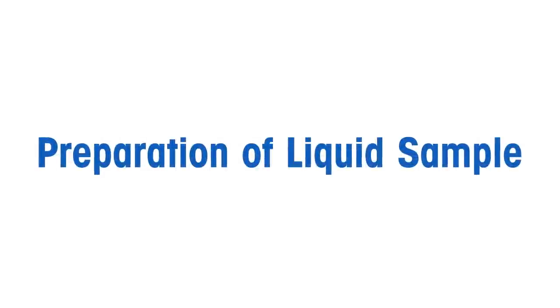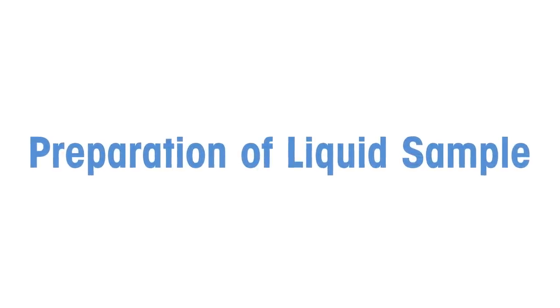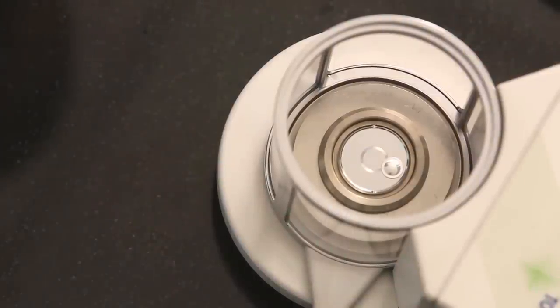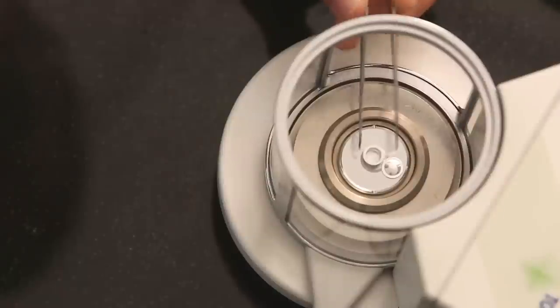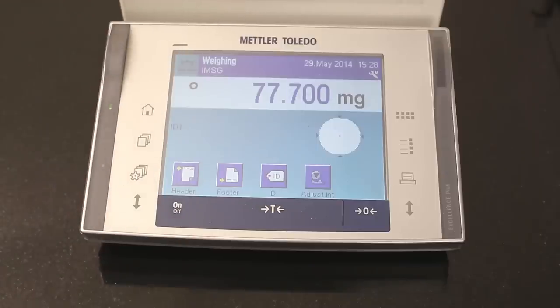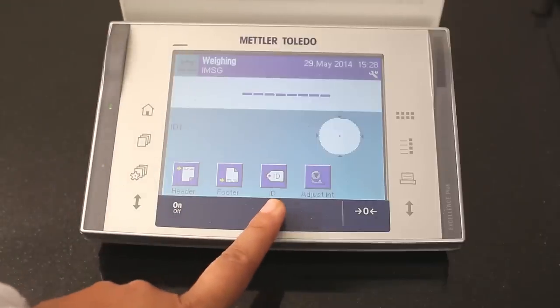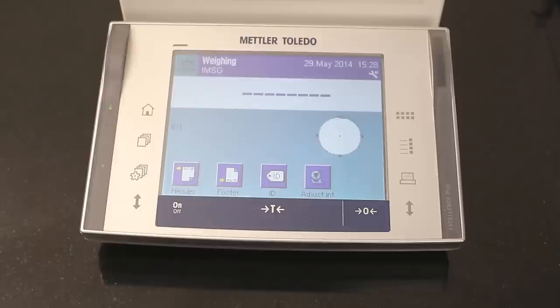For preparation of liquids in 100 microliter aluminum crucibles, we use lids as received to hermetically seal the crucible. In order to prevent reaction of the crucible with water, the crucible and lids can be stored in a desiccator with a wet atmosphere overnight. The aluminum surfaces then will be passivated.